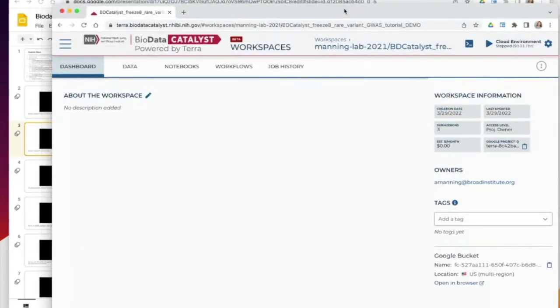No, the data is being prepared for you to get in a subsequent step, which I will show you. You will only be able to get that data after a check on your credentials to make sure that you are, in fact, authorized to access that data set. So I will show you how we import a data set from PIC-SURE into the workspace in a notebook. Oh, got it. Thank you so much.